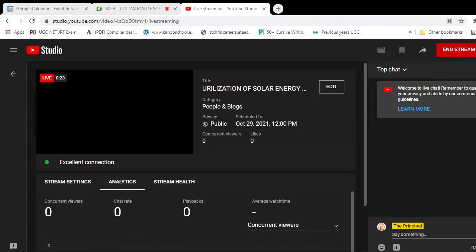Morphological characterization. Morphology is nothing but the surface of a material. It is analyzed using SEM analysis, which is a scanning electron microscope. You know about cameras, where you use photons as a light source, but here we take the same kind of photographs using an electron source. It is very interesting: you can explore the surface of the material using the electron source, and capture the pictures of this material.